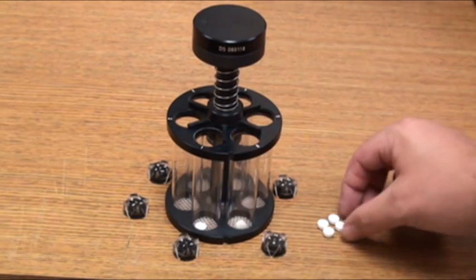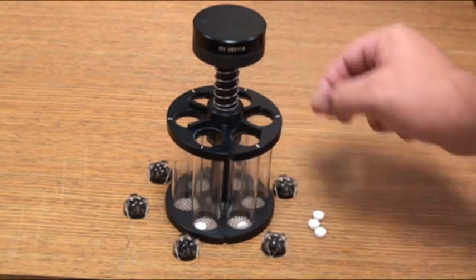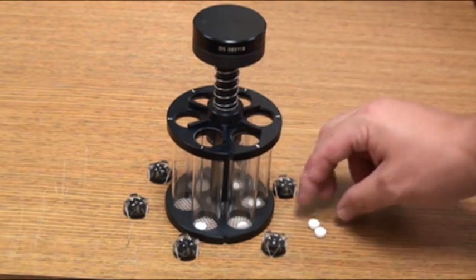The basket is completely protected against corrosion, plus the transfer signal is contact free.